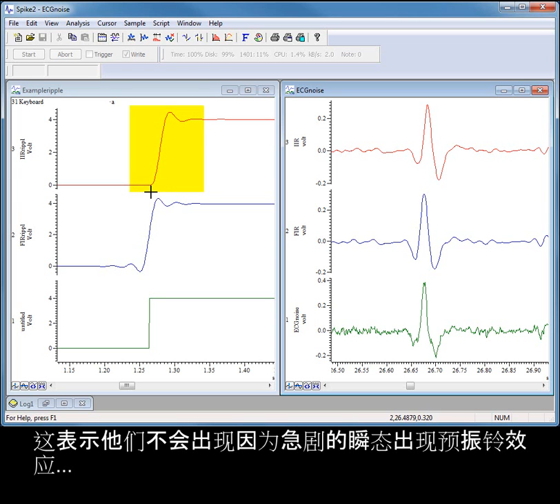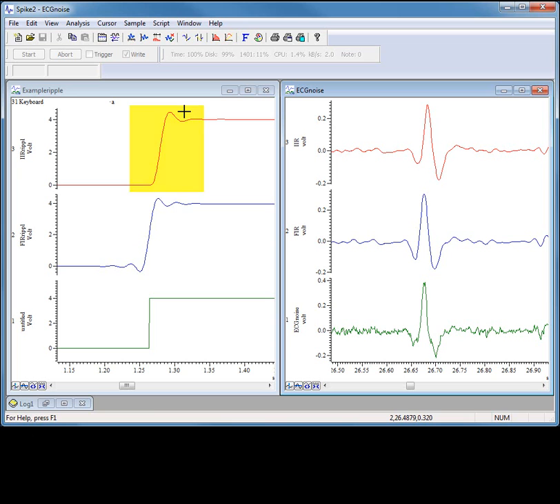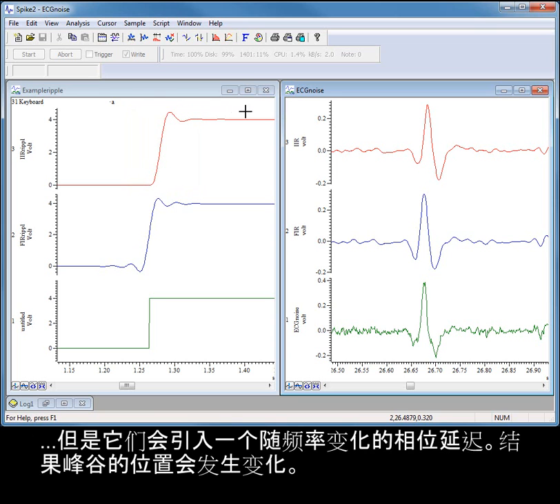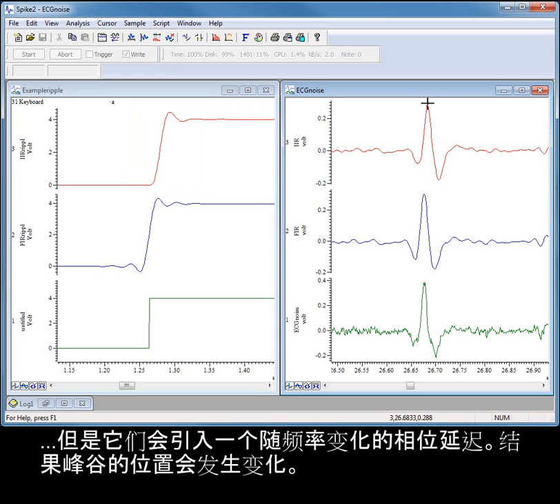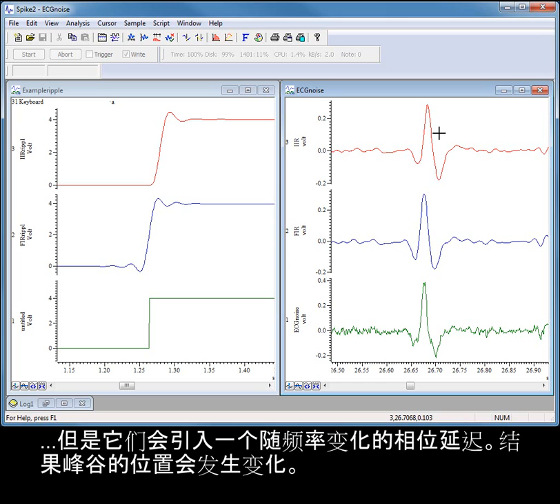This means that they do not suffer pre-ringing effects due to sharp transients. But they introduce a phase delay which changes with frequency, the result of which is that the positions of peaks and troughs will change.